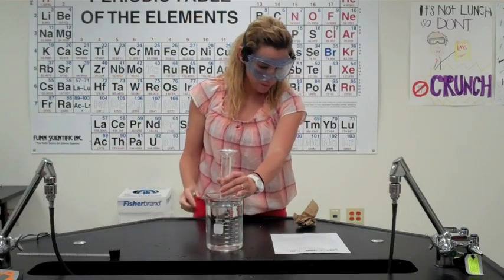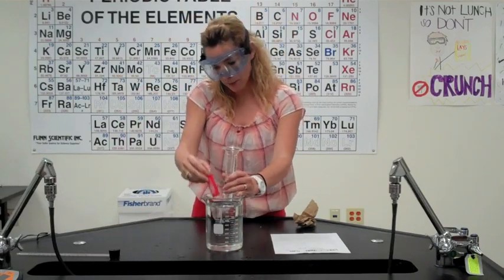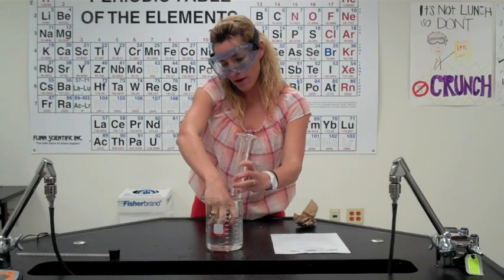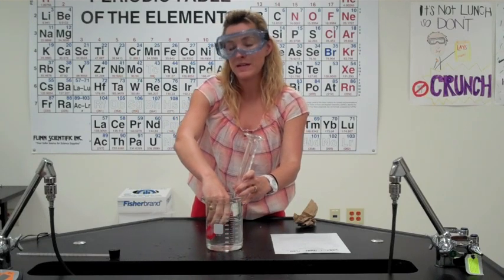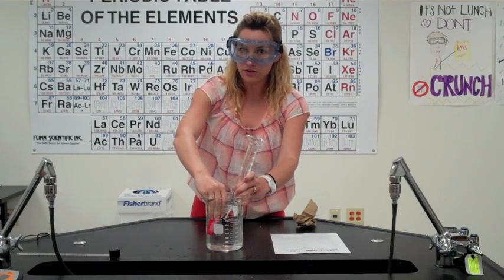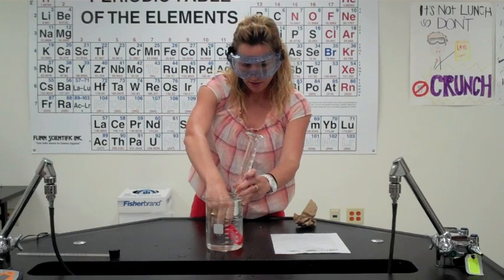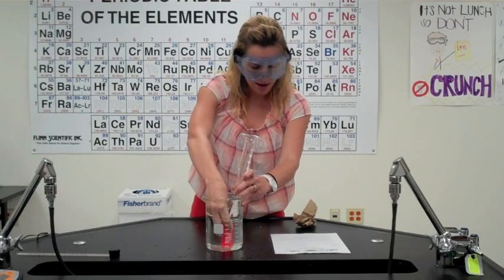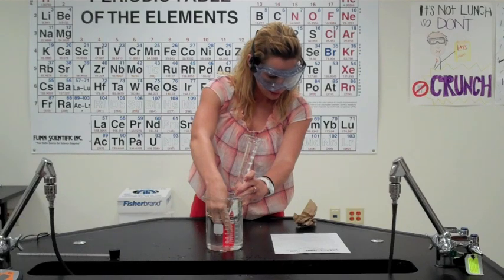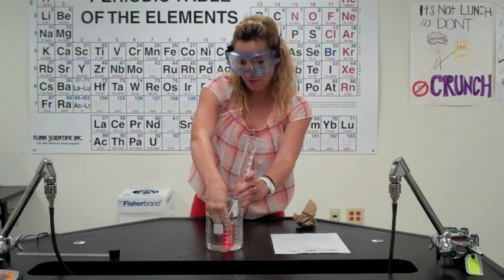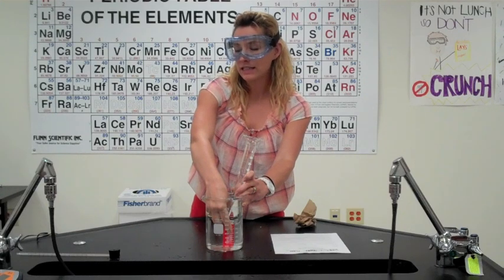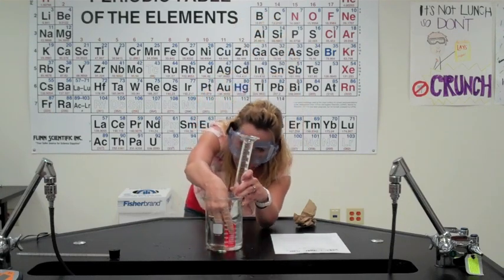The next thing that you're supposed to do is take your butane lighter and put it directly underneath your graduated cylinder. Once you have the graduated cylinder in there, be careful not to lift the opening of the graduated cylinder above the level of your water bath because if you do that then your water is going to come out. I'm just going to position the butane lighter under here. The procedure says collect about 90 milliliters of the butane in this graduated cylinder, and then to collect the last 10 milliliters we're going to have to adjust our graduated cylinder.